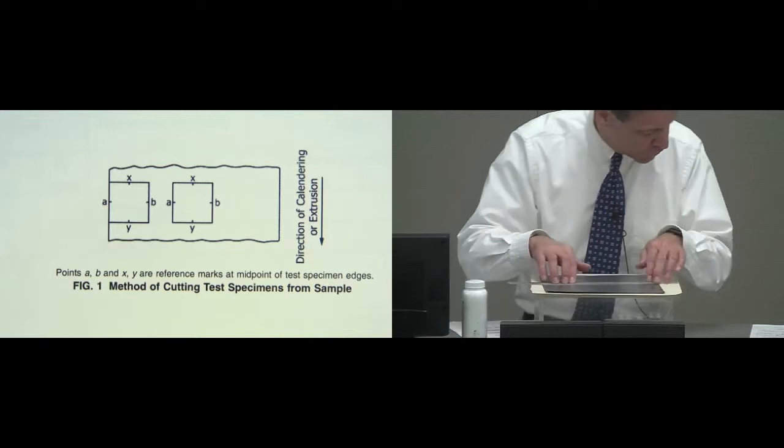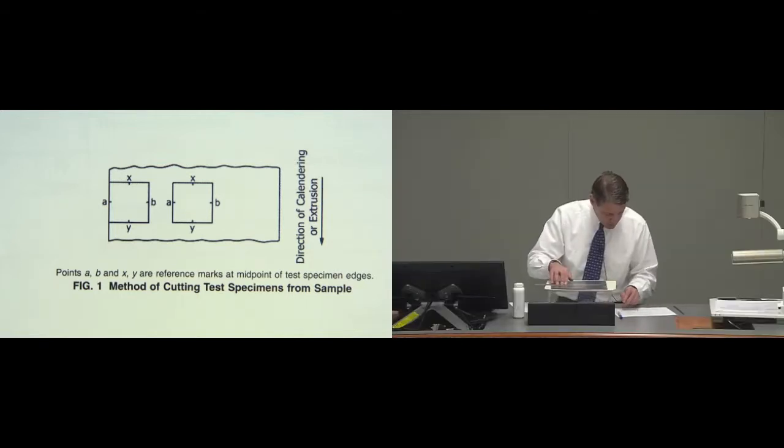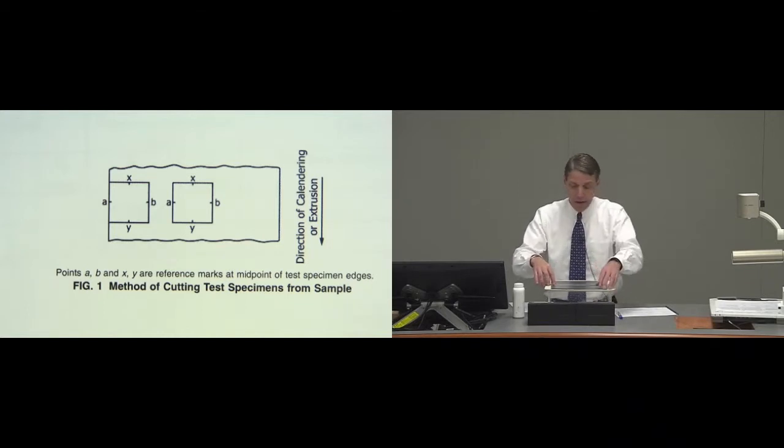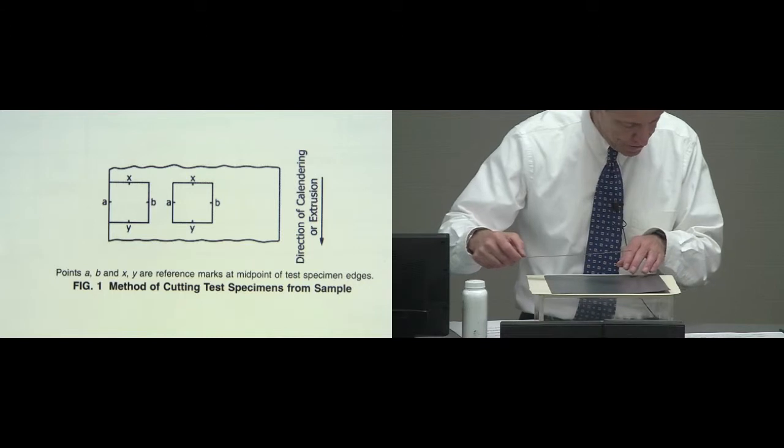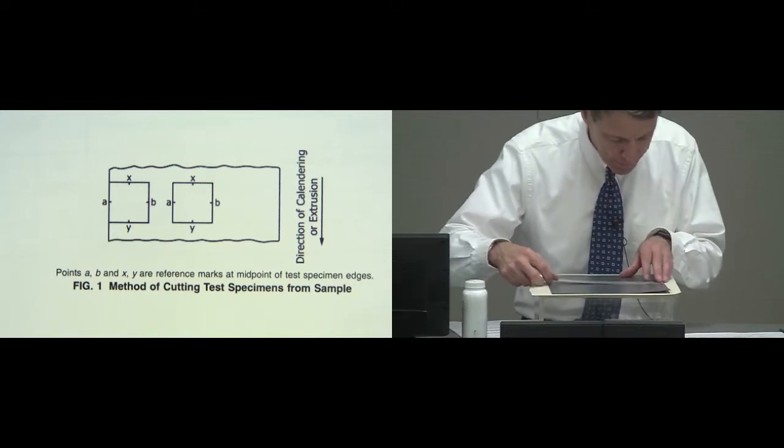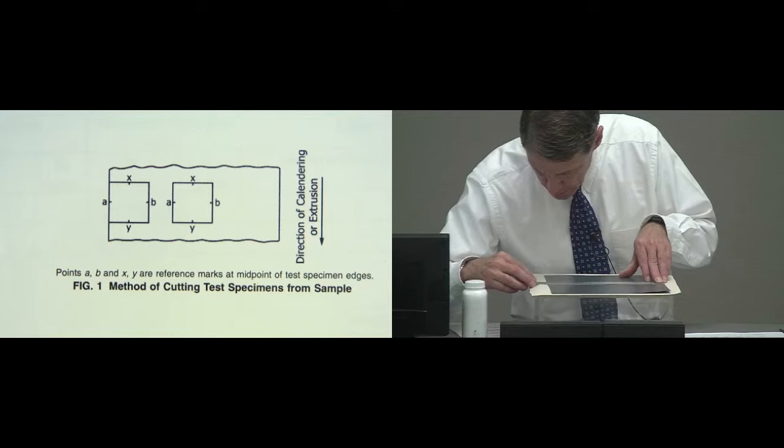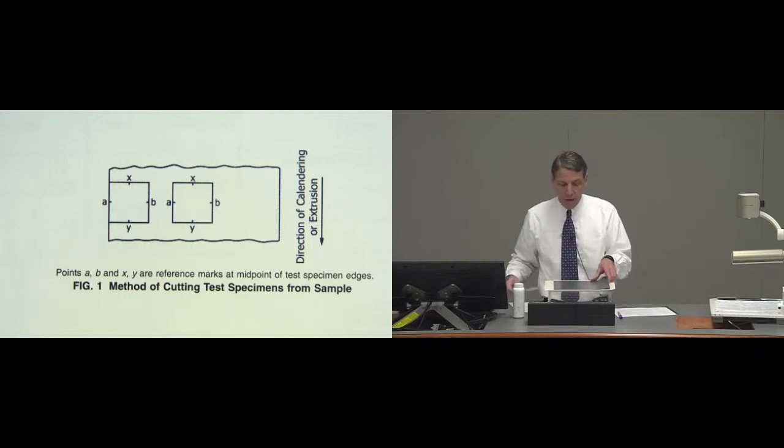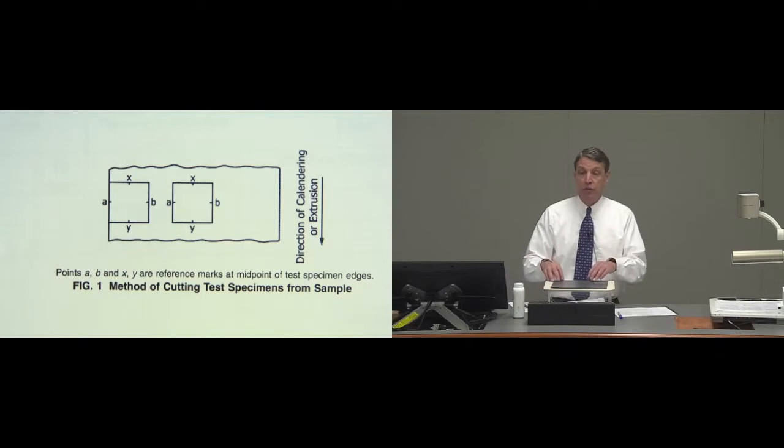So in the transverse direction I measure 251 millimeters and now in the machine direction I measured 252 millimeters. I would do the same. This happens to be the edge specimen.